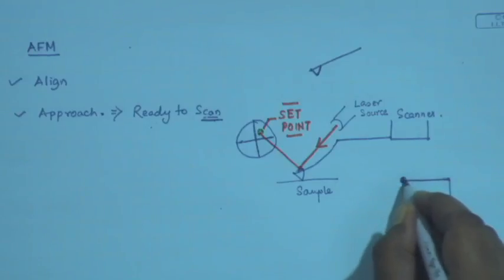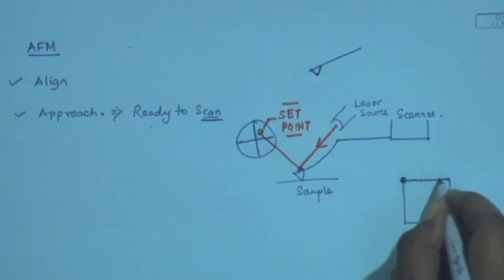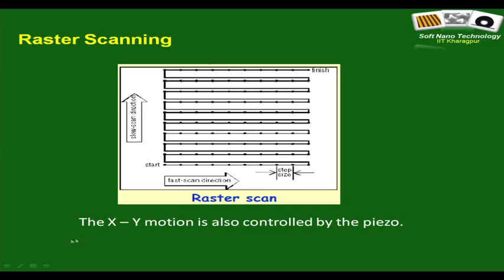Typically what it does, it goes on collecting data at all the points over here, as it is, let us say, shown in this graph. It goes on collecting. So, here it shows as if it is starting from this point, it is all the same. So, it goes collecting data at all these points here, then it comes back, goes to the next level, collects all the points. So, it is a simple double do loop, and you have the option of choosing which way it will go.